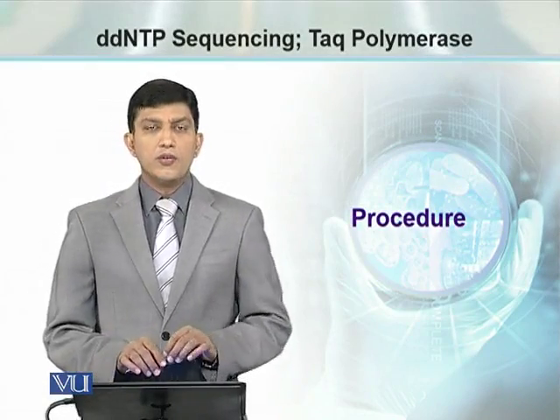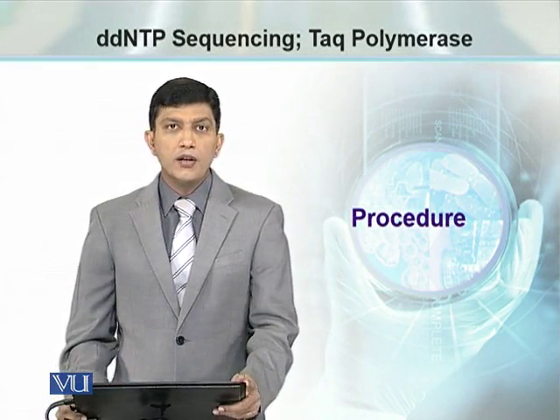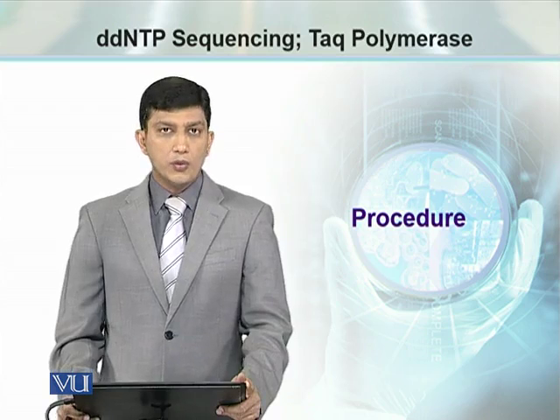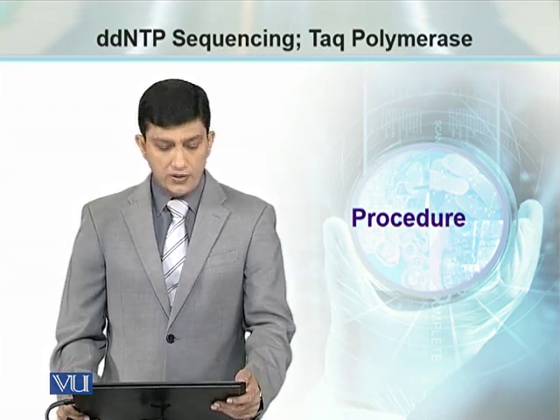This module is going to deal with the procedure and the steps which are required to perform the ddNTP sequencing procedure using Taq polymerase as an enzyme.